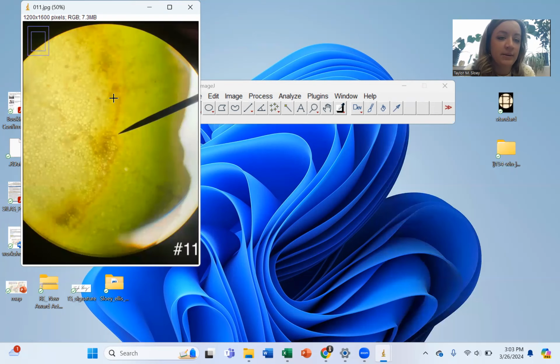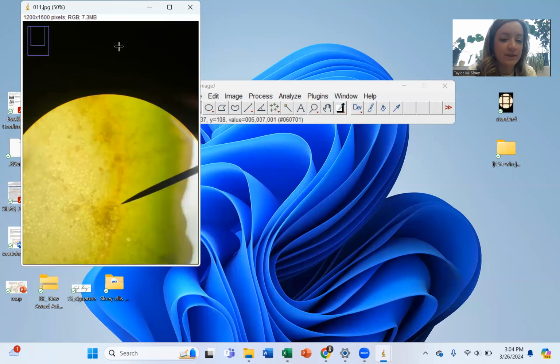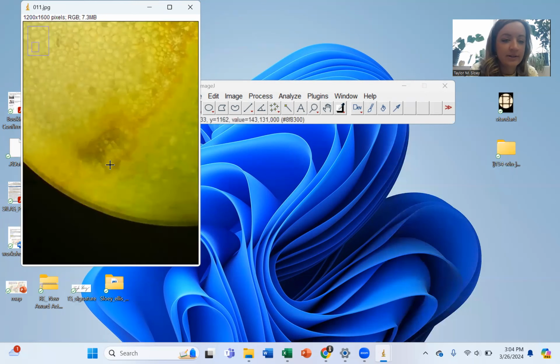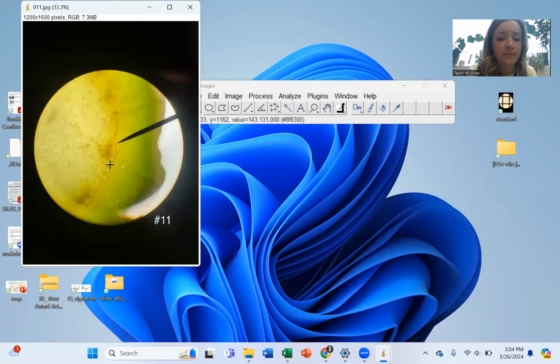And in each cross-section image, you might be able to see a few different xylem bundles. Some are going to be better fields of view than others, just based on how the microscope was positioned. So I would encourage you to select whichever one is the easiest to view and has the clearest, cleanest imagery of those xylem bundles. Okay, so this is what we're looking at.